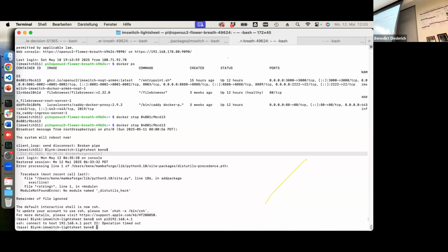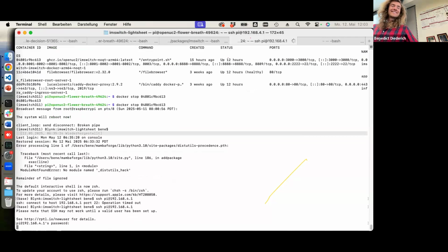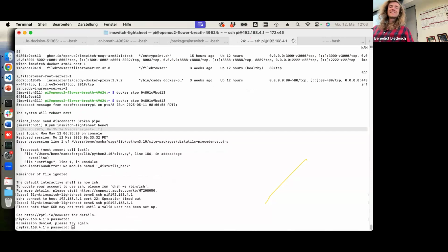It's a bit of a pity that this doesn't work, but that kind of live demo is all. Yeah, it should. When I see a lot of this stuff, I think of how a lot of fancy microscopes have all that kind of thing. Everything's very isolated from dust. Does that end up exactly overhyped? Well, no, it's not overhyped. I think you'll see that. But in a way, it's also a good thing because you can actually open things. Yeah, like you can open it.